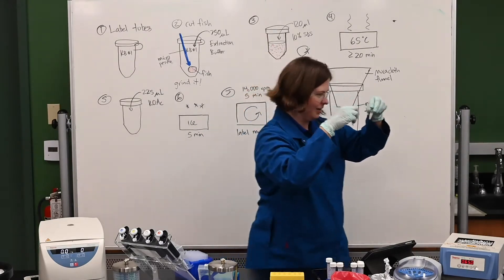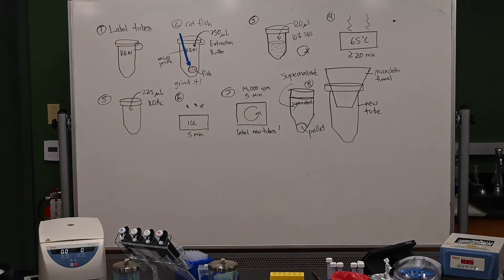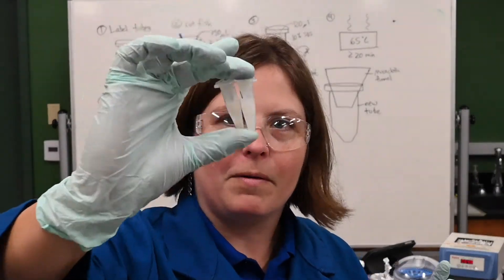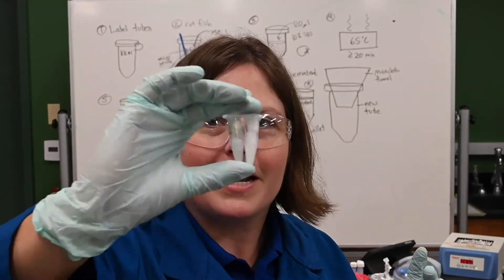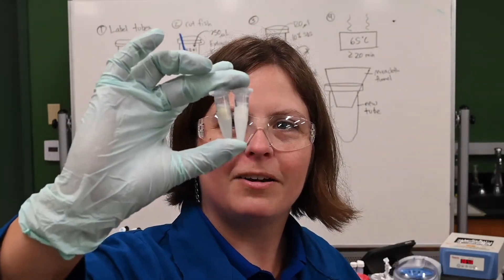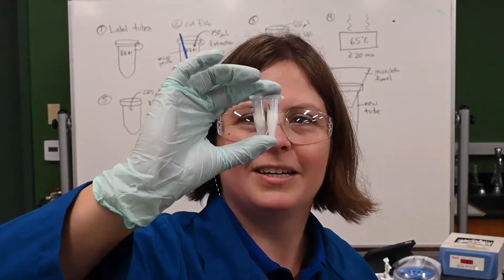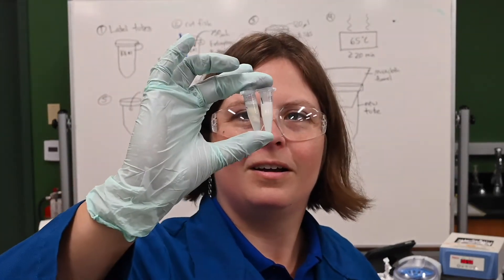All right. So I added that and look, it has turned super cloudy. That's exactly what we want. It was a little cloudy before, but now with the potassium acetate, it's super cloudy. That is the SDS precipitating out with more of those lipids. So cool.